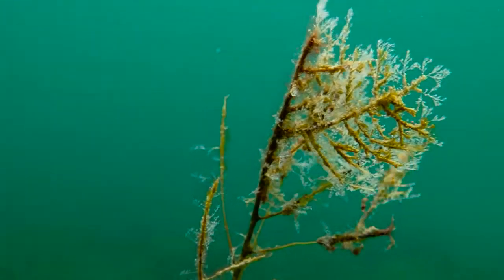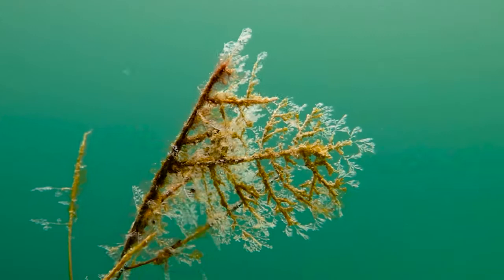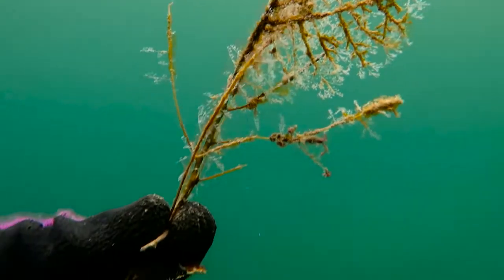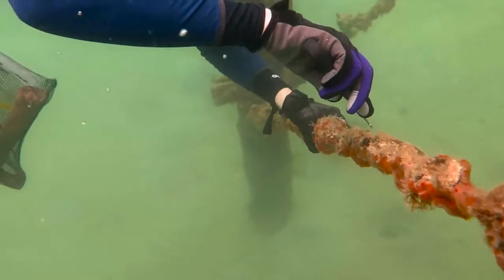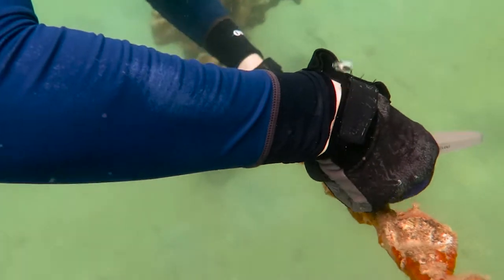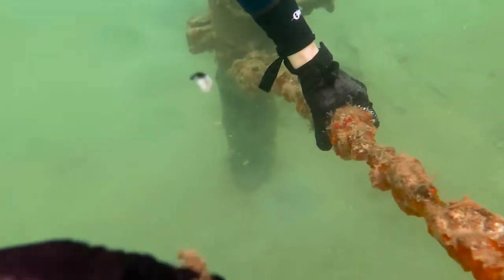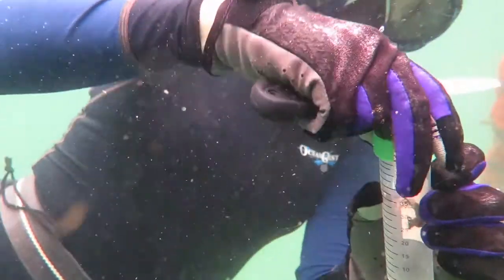Colonial hydrozoans can form beautiful big colonies easily visible with the naked eye, or very small and delicate ones that are very hard to spot. If the species you're interested in is very small, it's probably best to collect the substrate it grows on, even if during the sampling you cannot see it.